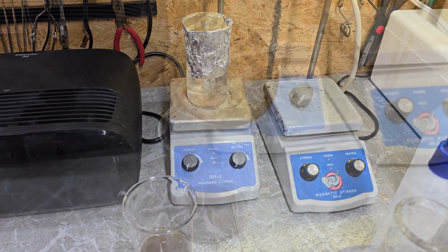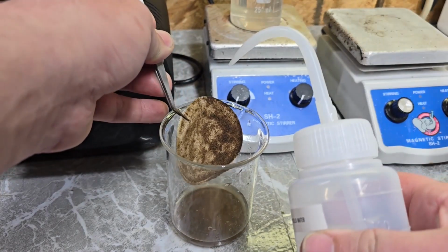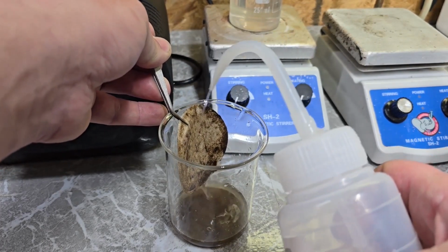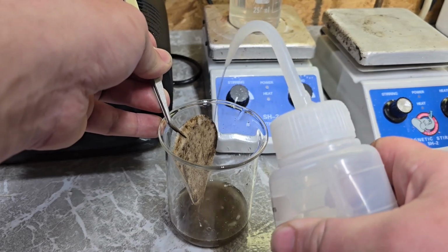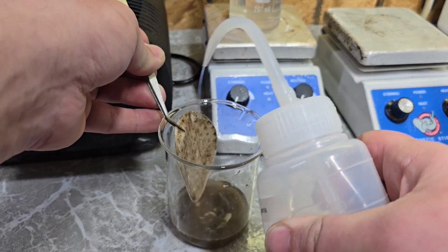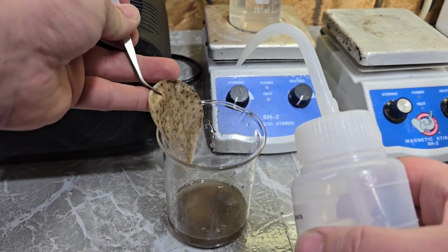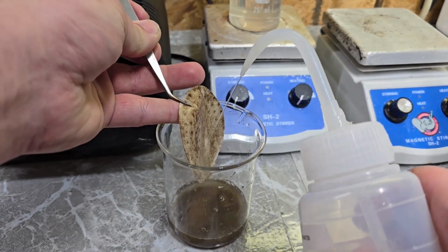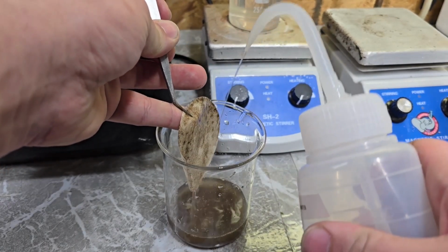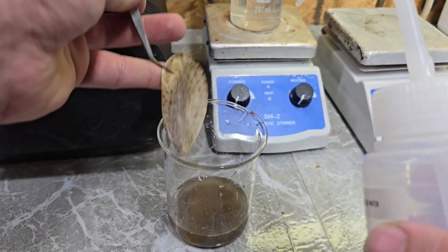Alright, let me lower this down. I have a wash bottle here with some distilled water, and I'm just going to rinse that in there. I don't want to put a whole lot of water in here. I do want this to be relatively concentrated, but I also want to try to get as much stuff as possible within reason. So, get this little guy right there. Just use the stream of water coming out of the nozzle here to knock as much stuff off of there as possible. I think that's good. I don't want to dilute that any more than it already is.